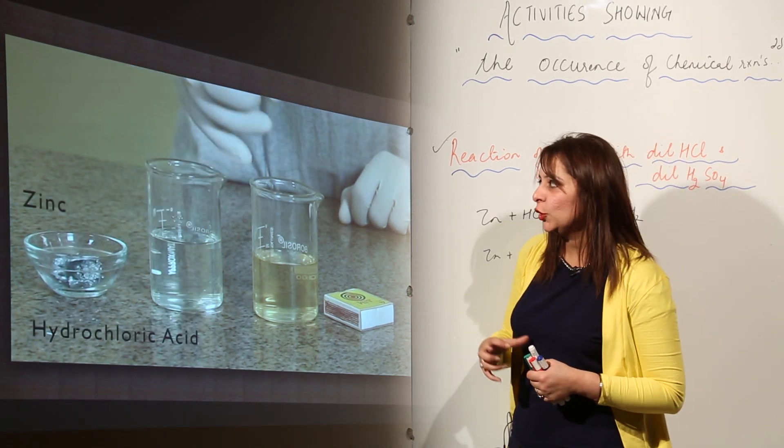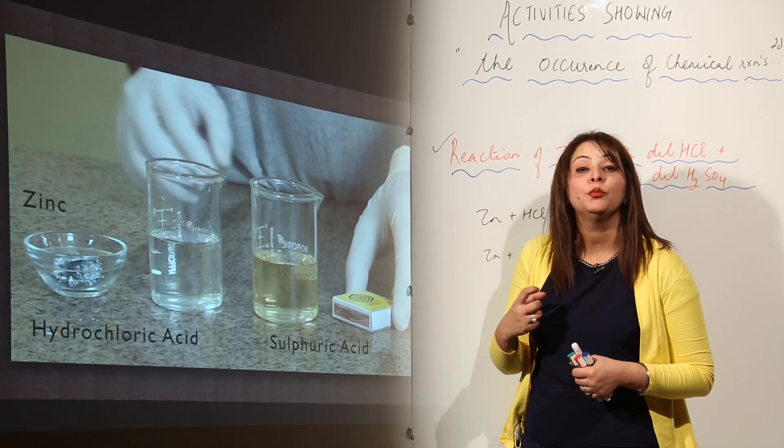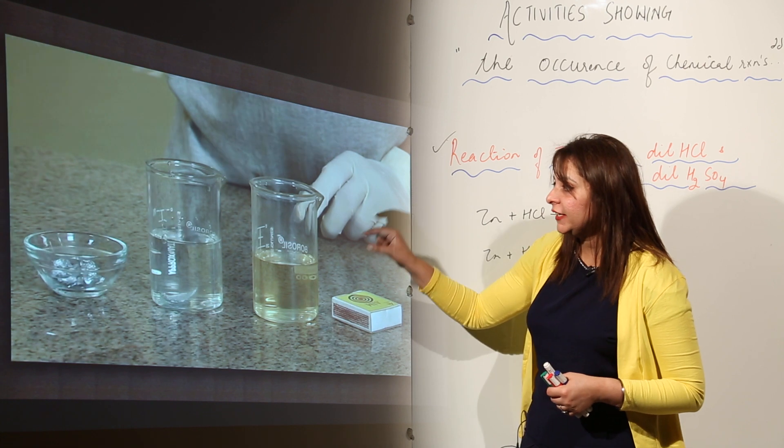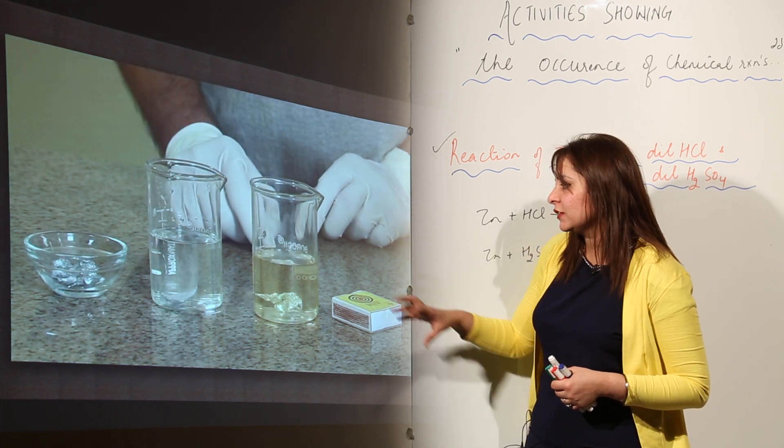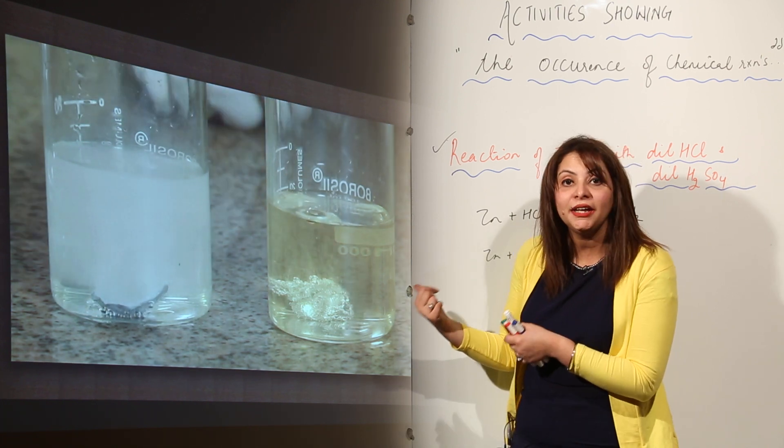We have zinc granules, we have the beaker with HCl, we have the beaker with sulfuric acid, and both the acids are dilute in nature. Now we are going to add zinc granule in HCl and the same mass zinc granule in the dilute H2SO4.